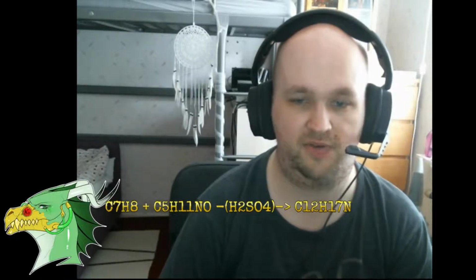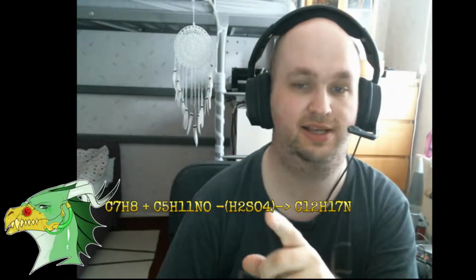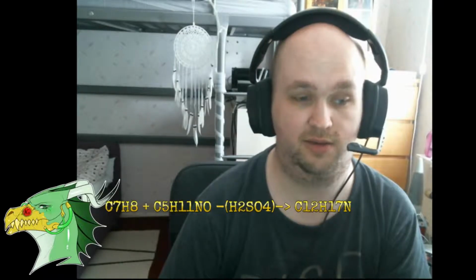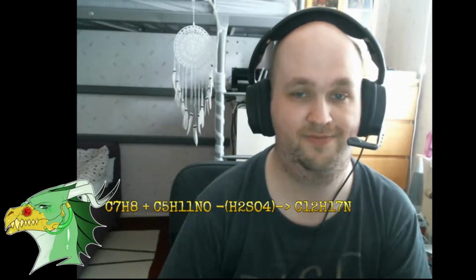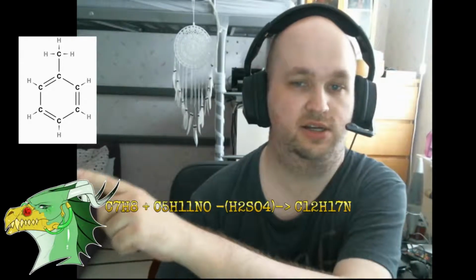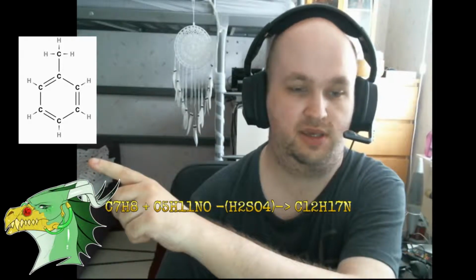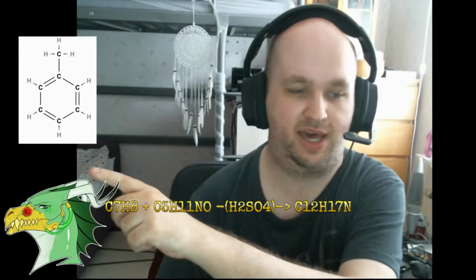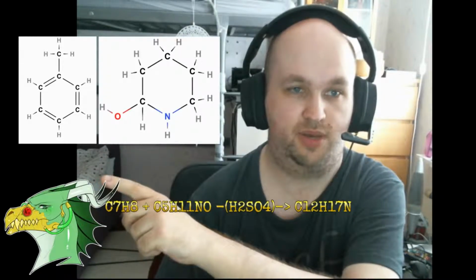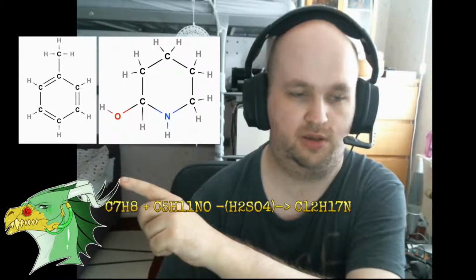Now, for the first reaction, we're gonna be having to do this little reaction. And I know you probably say, what is this even meaning? Well, I can tell you. First you have one part with toluene that you later react with, what the heck, piperidine 2-ol.